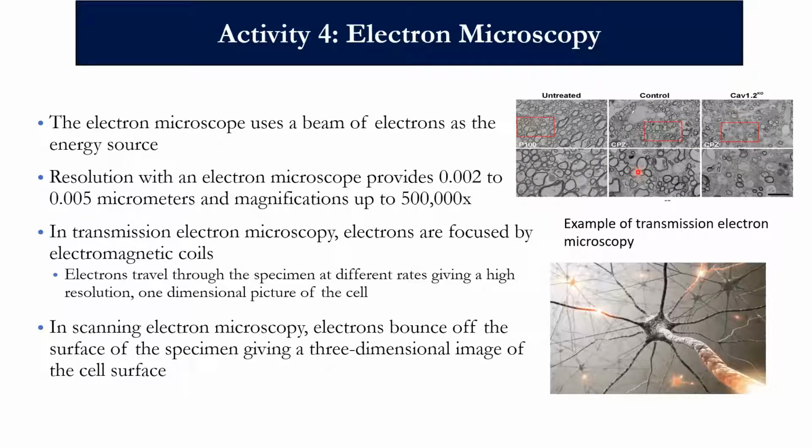So here what you are seeing is the close-up of this image here, essentially. In your brain, you have these cells called neurons. These neurons are very powerful cells, and they have dendrites that receive chemical messages.